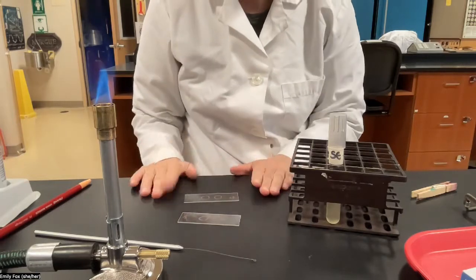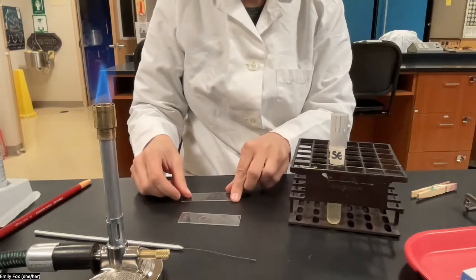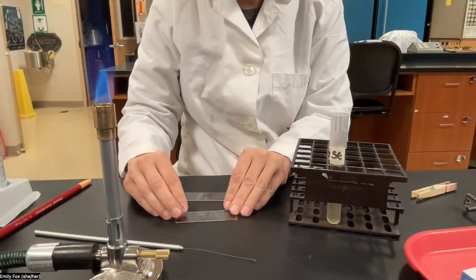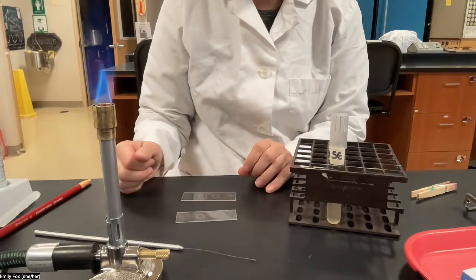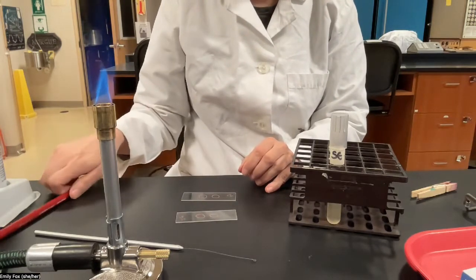And now this part's really important. You're going to turn the slides over so that the part you wrote on is facing down. We want to put the bacteria on the nice clean side so that when we stain them, the wax crayon doesn't get in with the cells.